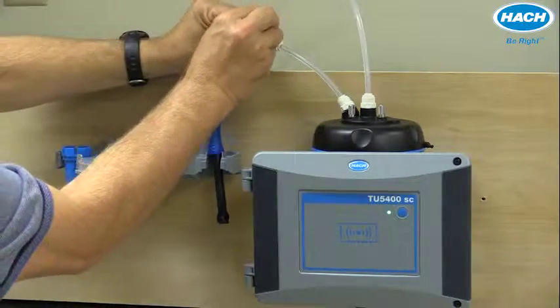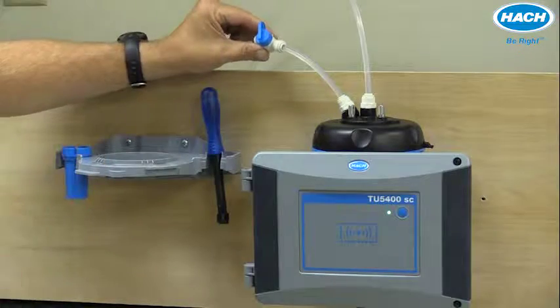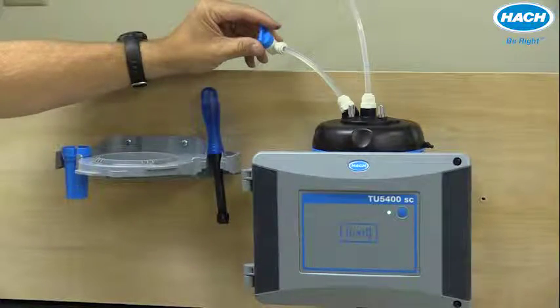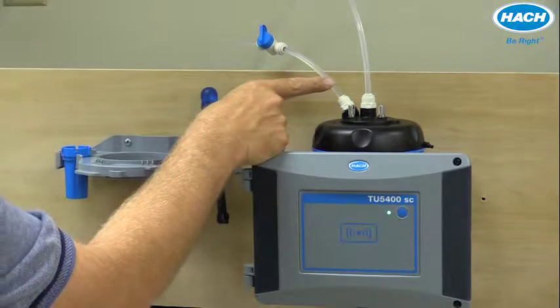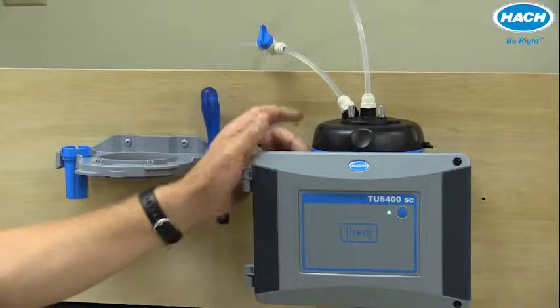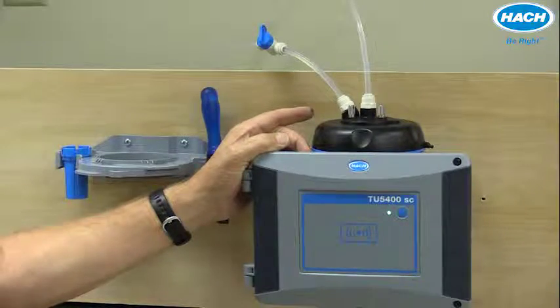I can open up the ball valve and commence flow through the device. The allowable flow rate is anywhere between 100 and 1000 milliliters per minute. The optimal flow rate, however, is between 200 and 500 milliliters per minute.